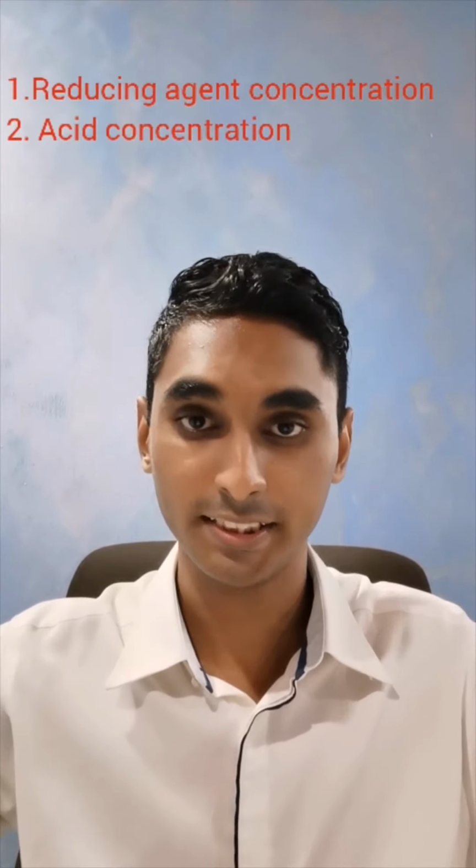First of all, 30 ppb of the standard solution of mercury, arsenic, selenium, and antimony were used for all the optimization process. There are a few parameters that were optimized in this experiment. The first two are the concentration of the reducing agent and the concentration of the acid.